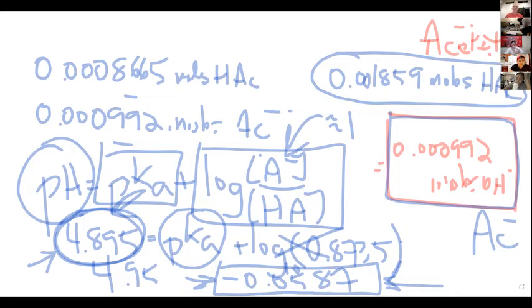Yeah, if you get a positive integer, you get a negative integer, it doesn't really matter. It's going to be small. It's going to be really close to zero. So don't worry if it's a little negative, it's a little positive. Do worry if you get something like 2 or -2 or something like that. Then something's screwed up. Because that ratio of conjugate base and acetic acid should be pretty close to 1. Because that's the whole point of being the midpoint. You have converted approximately half of the acetic acid to acetate ion. That's what should happen at the midpoint.